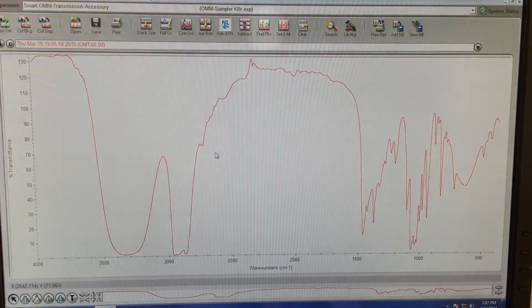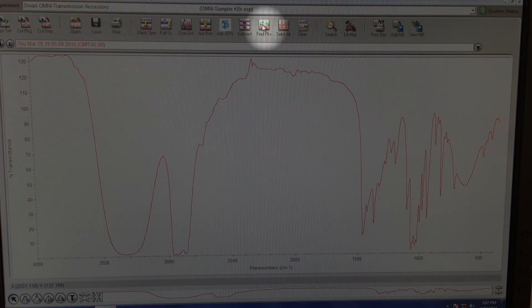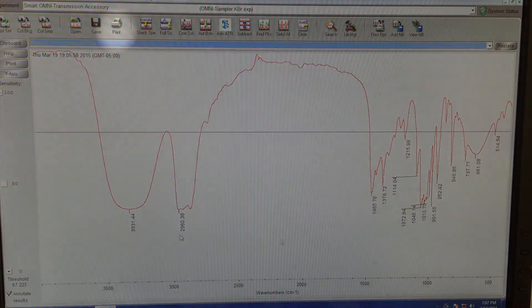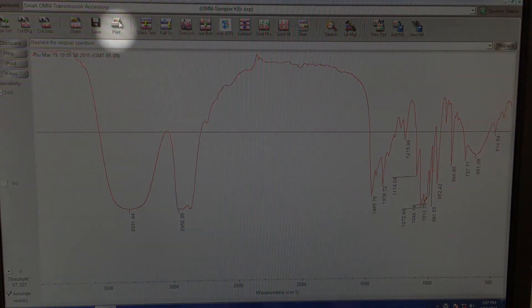Then click Find Peaks. You can adjust the detection threshold manually. Finally, click Print to produce a hard copy.